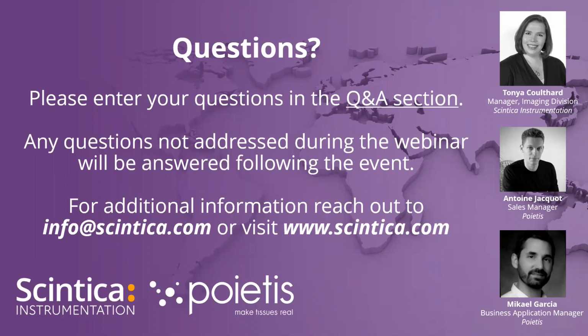I know there were questions during the first webinar about using heat, for example, to cross-link the collagen. With that, the team has just been taking the plate out, throwing it into an incubator for a few minutes as long as is needed to do the cross-linking, and then placing it back into the instrument. So there are different techniques that may be used, but if you are using UV light, there is a possibility to integrate that within the system as well.